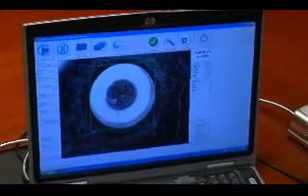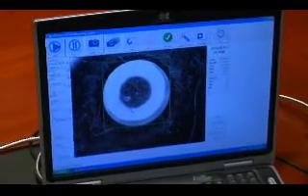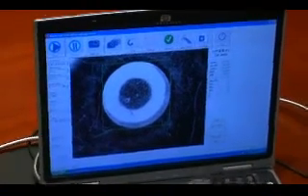It's a very flexible system, and you can upgrade it later on with additional lenses should you need to test — baby Brinell and so on.